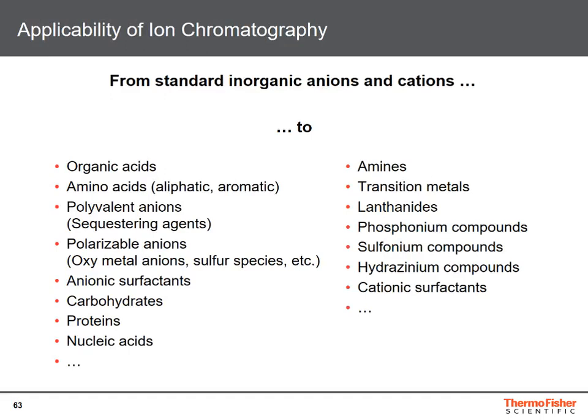Towards the end of my presentation, let me make a few comments regarding the applicability of ion chromatography. In my introduction, I have already mentioned that the perception of ion chromatography 40 years ago was completely different from what it is today. At that time, people believed that ion chromatography can only analyze inorganic anions and cations. Today we know that this situation has changed dramatically.